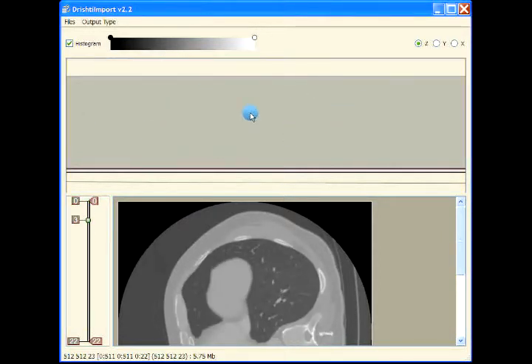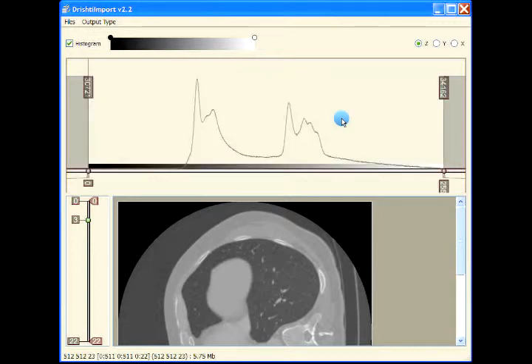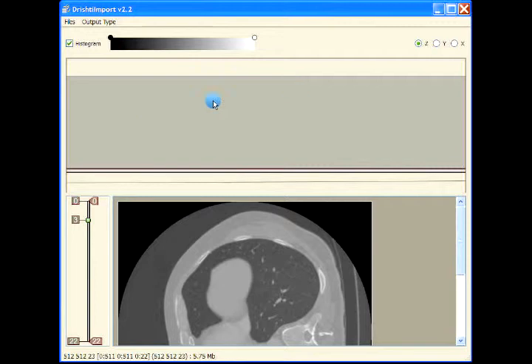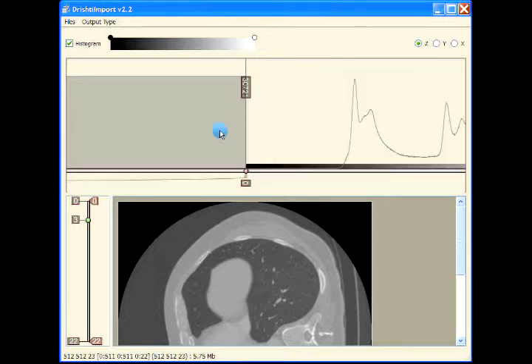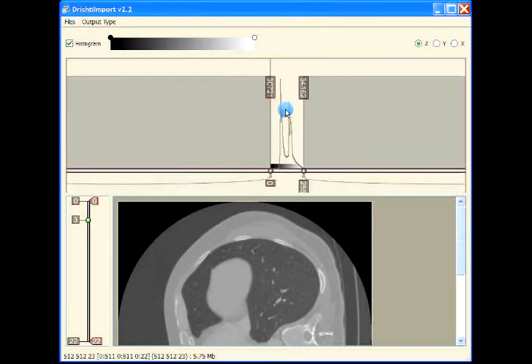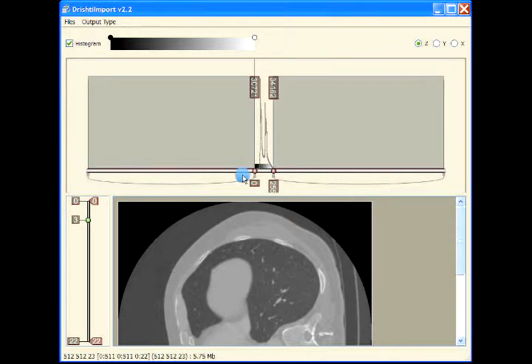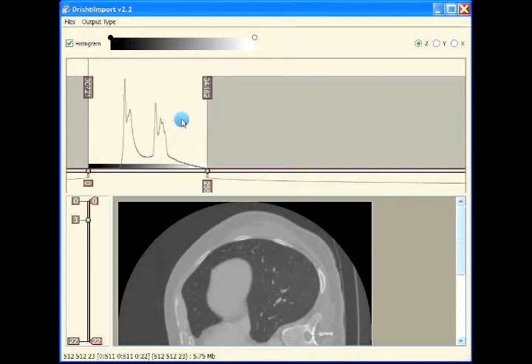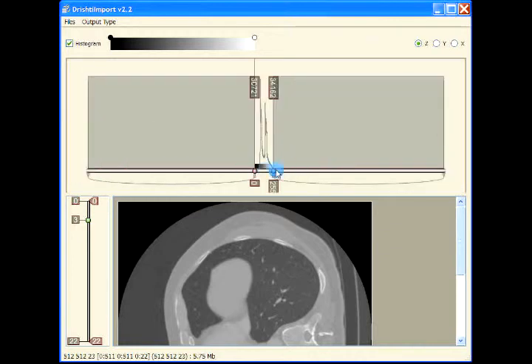Now here you don't see any histogram, but there is a histogram. Press H and then you will see the histogram. Initially what you would be seeing is something like that here. Actually the histogram is somewhere in the middle. If we use the middle mouse button, wheel it down, you will see that your entire data range is this big, and initially what I was showing is just this tiny part. So press H, that is home, and you will see your maximum and minimum range.